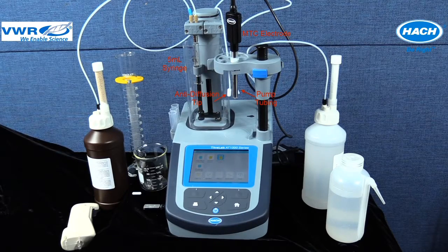The 5 ml syringe detailed in the application note has been installed on syringe port 1. This syringe port corresponds correctly to the location of the application on the first line of the display. The syringe tubing with the anti-diffusion tip from the dispensing side is fed to the sensor holder. The pump tubing from the dispensing side, noted with the upward arrow, has also been fed into the sensor holder.